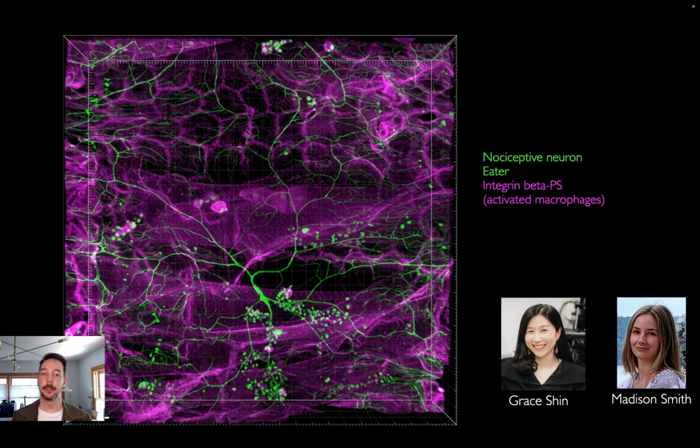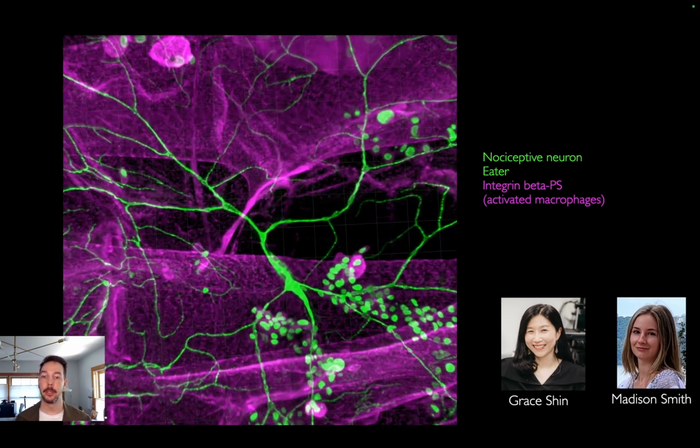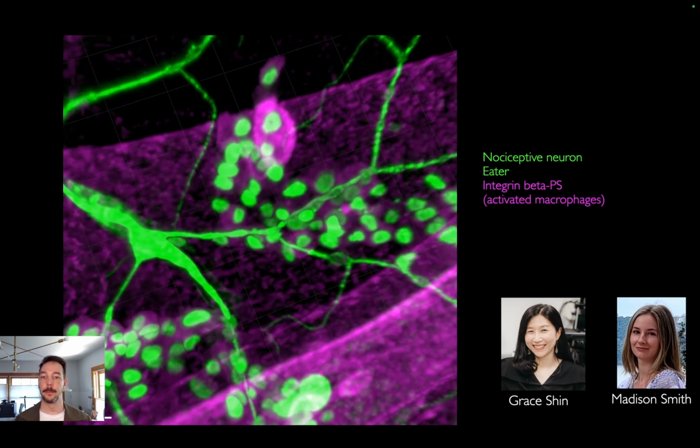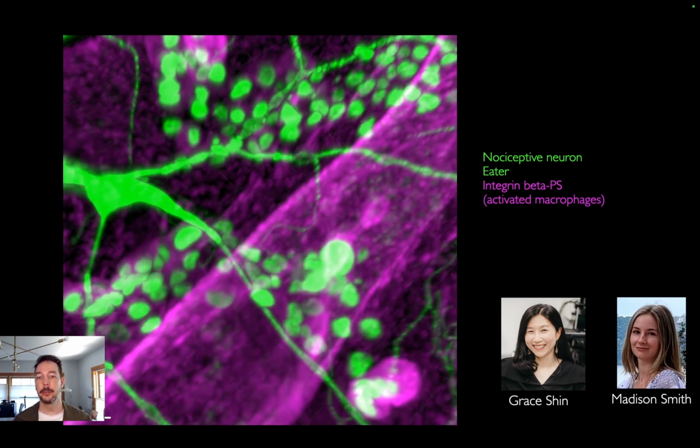So to give you an example of how these techniques can be applied, I wanted to share a collaboration with my long-term collaborator, Grace Shin, who's assistant professor here at Ohio State University, and her talented student, Madison Smith. And so what we're looking at here in green is a nociceptive neuron in the Drosophila larva, and we can also see in green immune cells. So these are resident macrophages in Drosophila, and the magenta color is integrin.